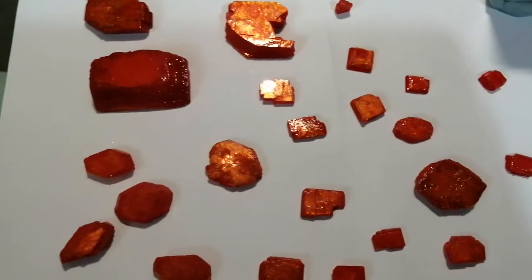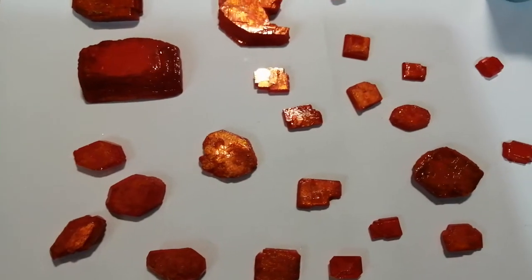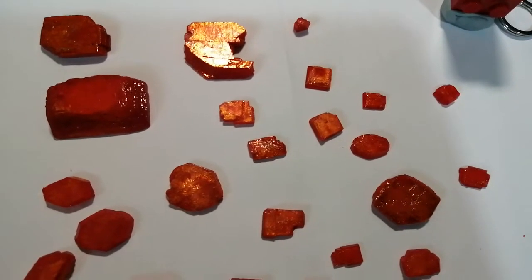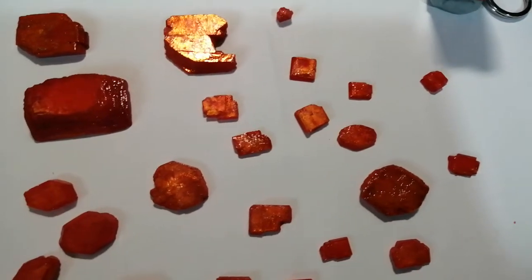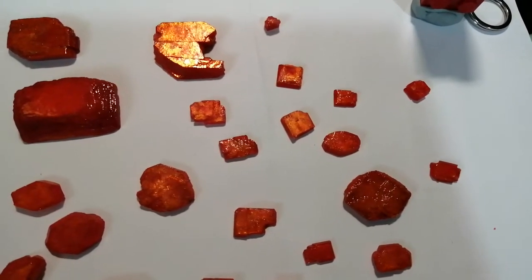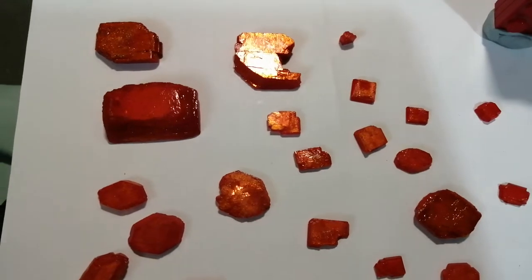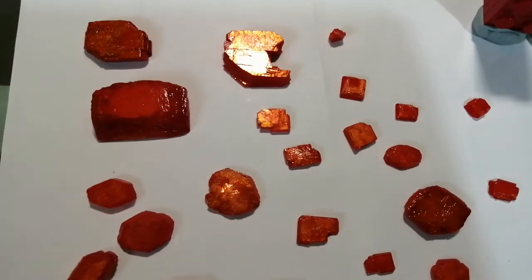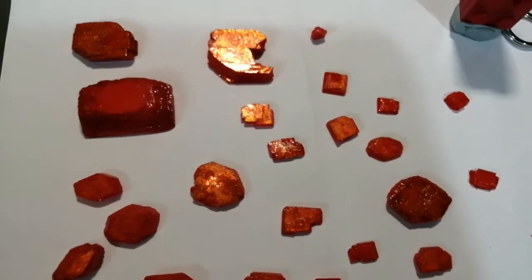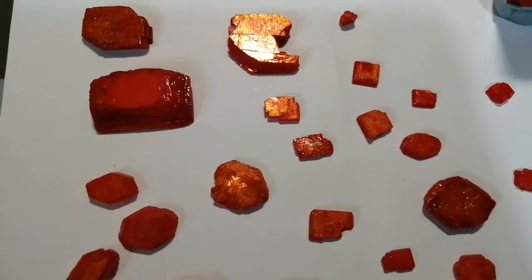The way I grew these was similar to the last crystals. I would put the solutions in small shallow containers, such as the top caps of vending machine hot drinks cups, because when they came as a tube they would have this cap to stop the tea or coffee or whatever from spilling out. I used to use those to grow the crystals, and I would top them up with some solution, stick them in this case in the airing cupboard, and let the dryness and the heat evaporate the chemical, turning them over from time to time, and then when they got big enough take them out.